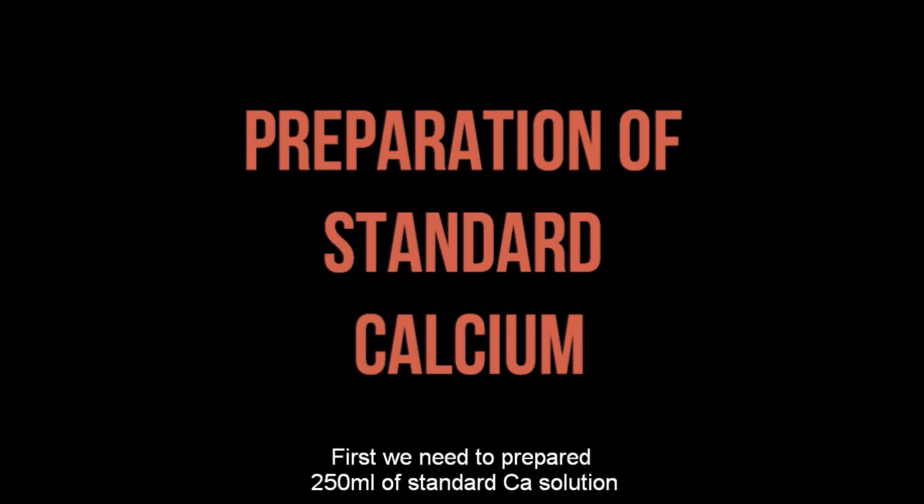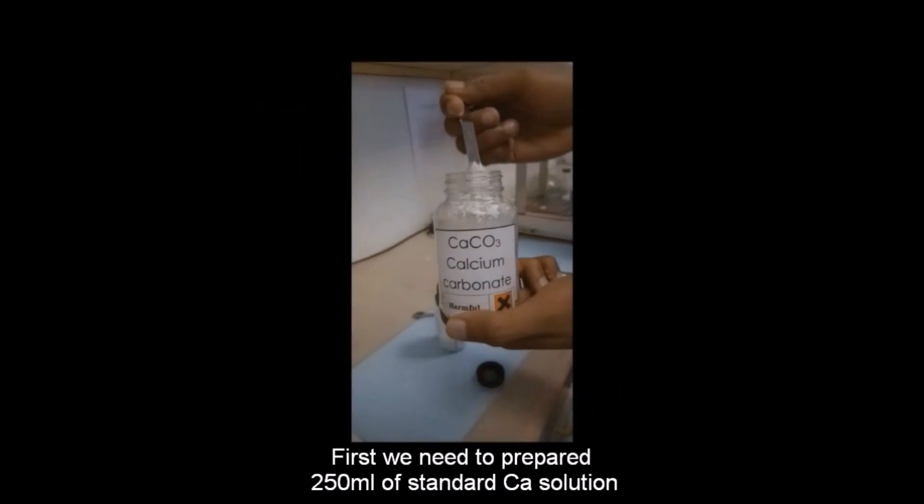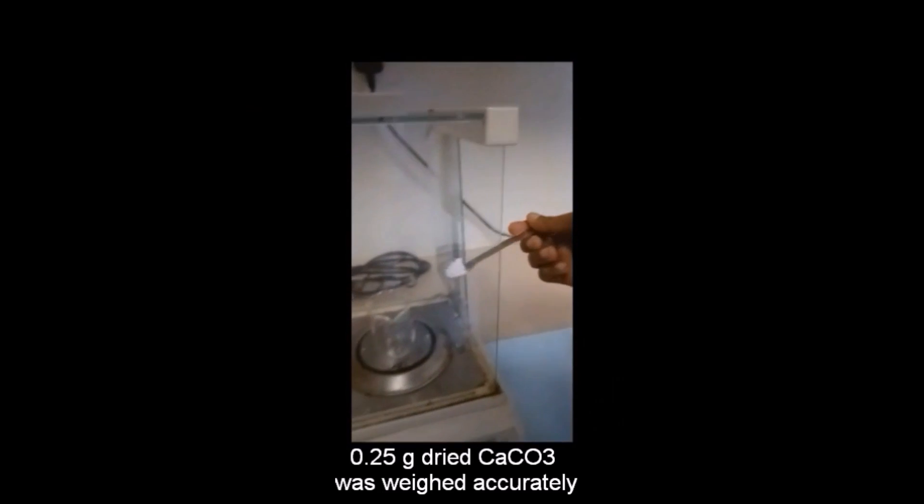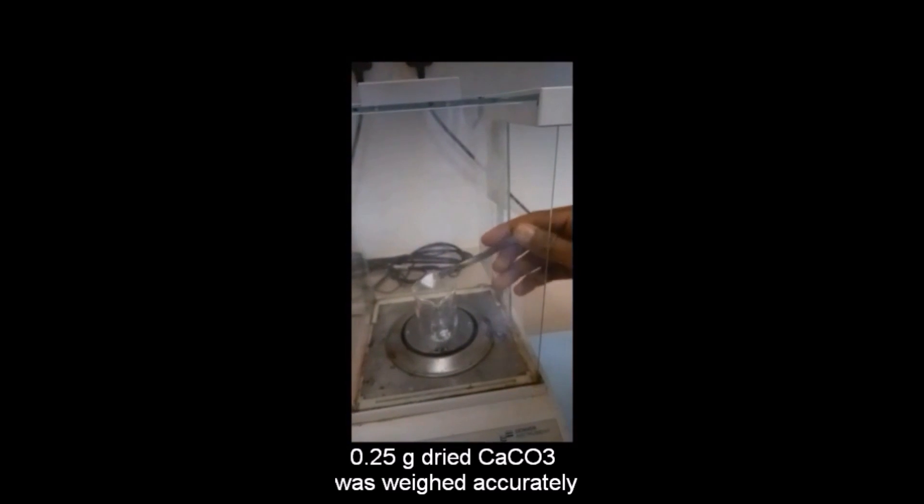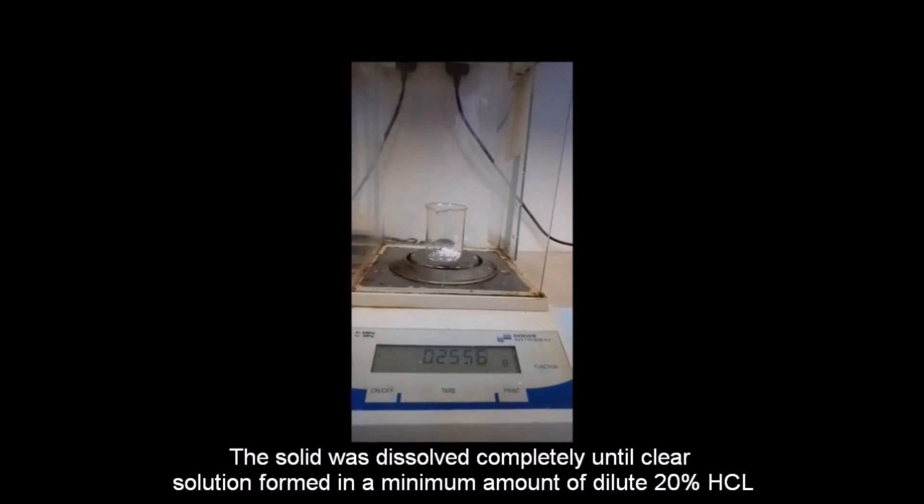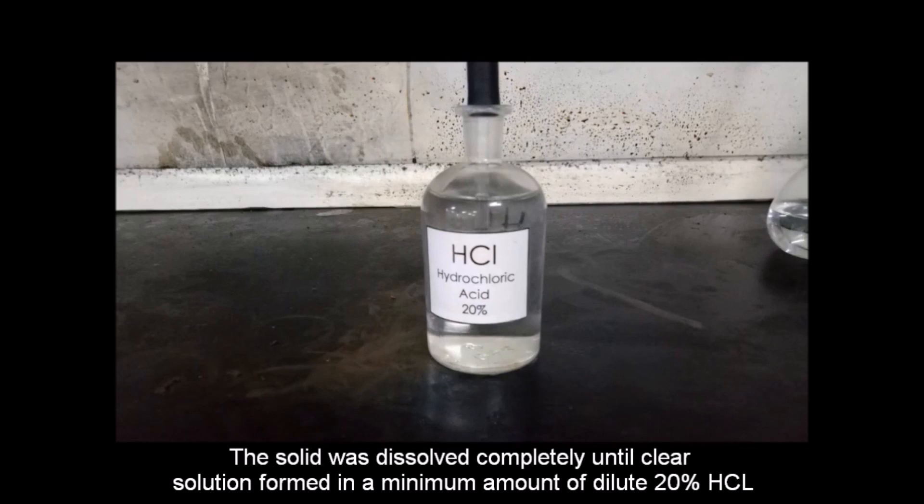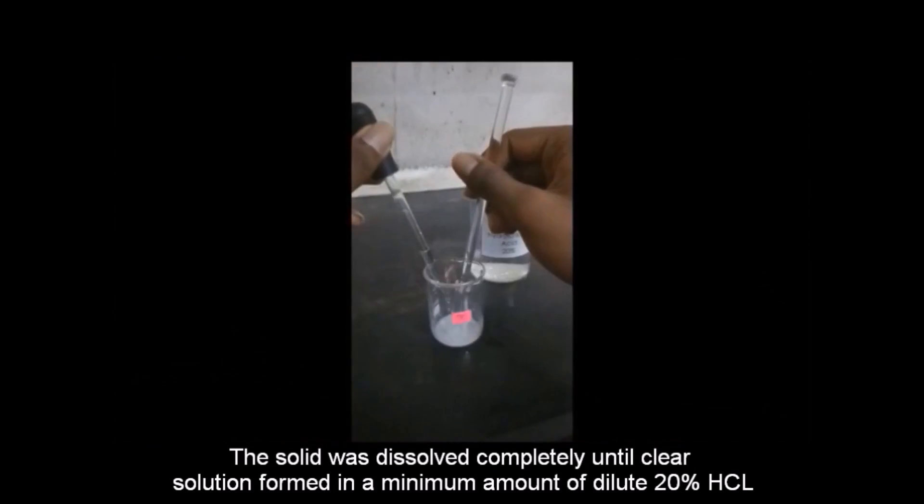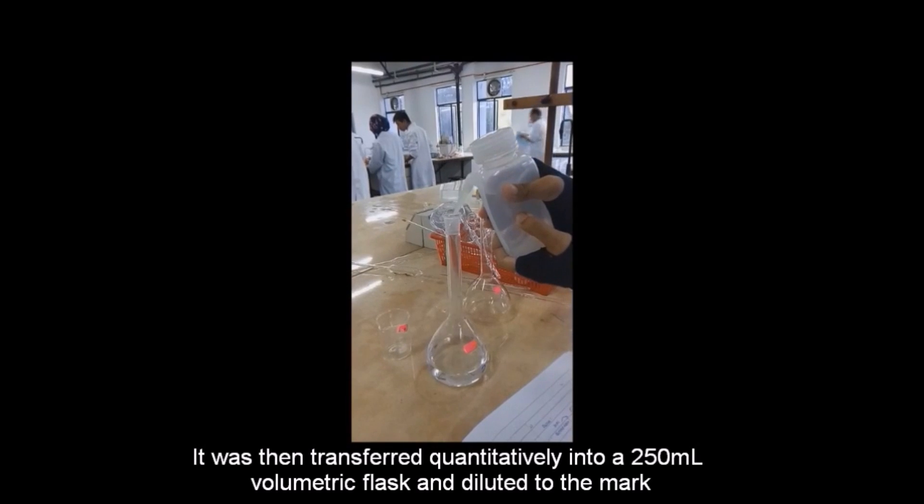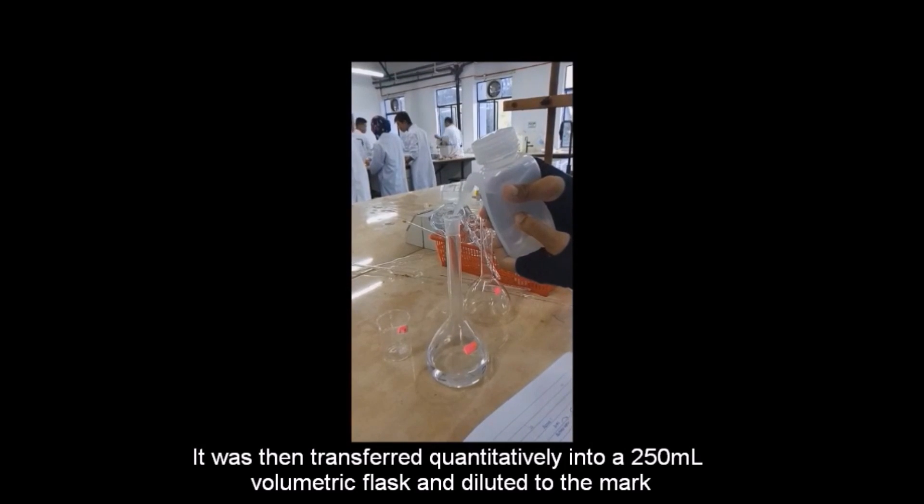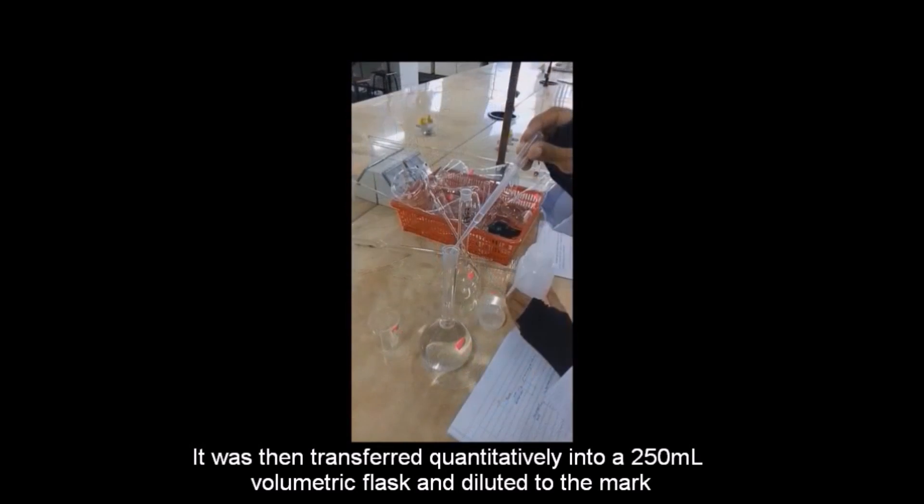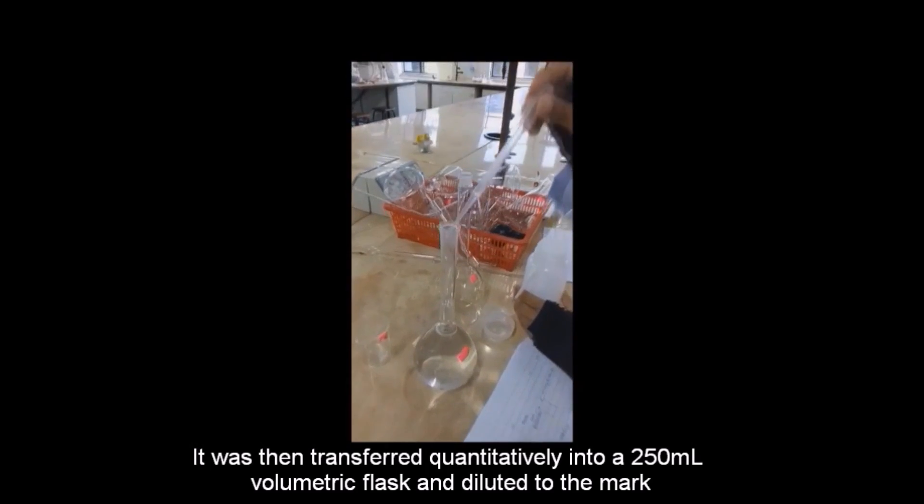First, we need to prepare 250 ml of standard calcium solution. 0.25 g dried calcium carbonate was weighed accurately. The solid was dissolved completely until clear solution formed in a minimum amount of dilute 20% hydrochloric acid. It was then transferred quantitatively into a 250 ml volumetric flask and diluted to the mark.